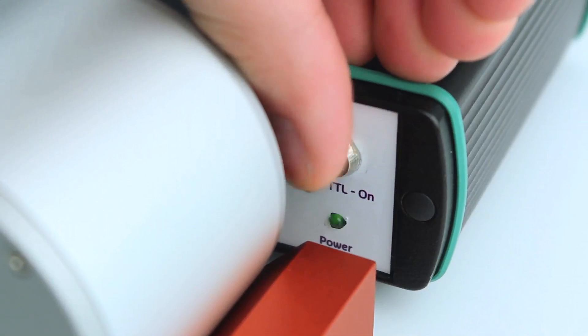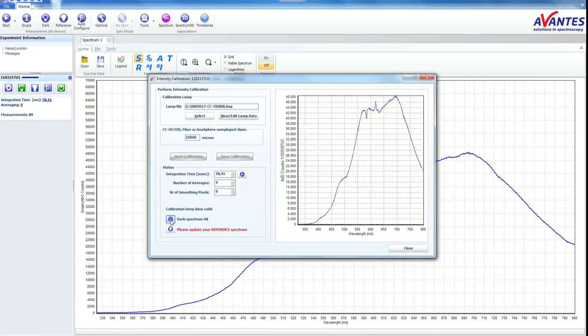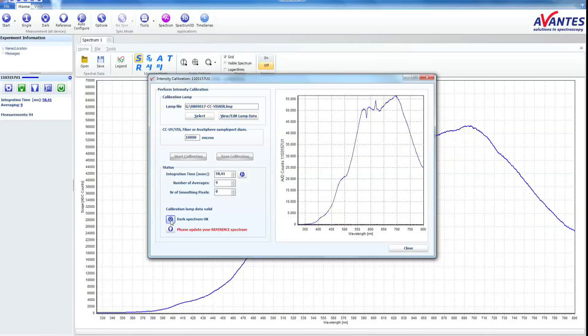Switch on the light source and take a white reference.